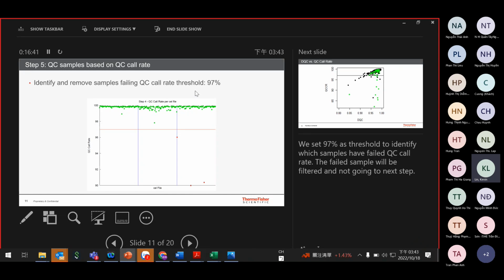Yeah, so another threshold would be the QC correct, which is 97%. So first number would be 0.82. Second number, 97%. Okay.